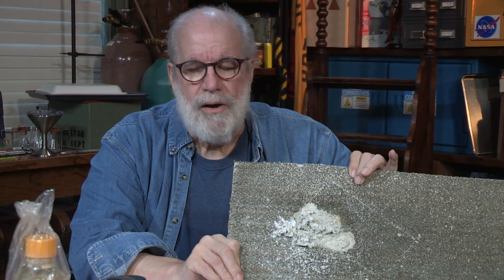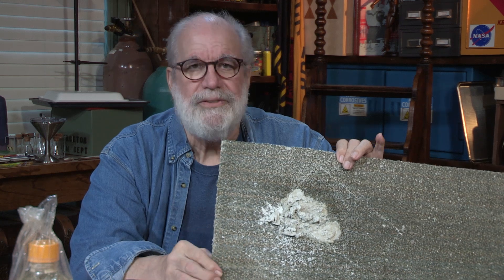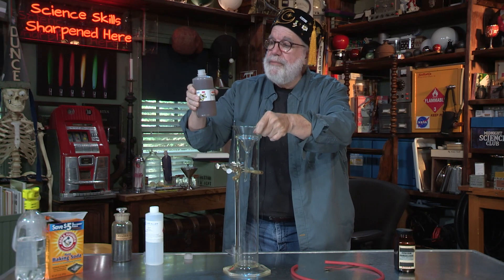I just wanted to show you something cool. I have carpet tiles here in the studio, which is also our lab, and we spilled some sulfuric acid. Better the carpet than me — that's what I always say. We're going to hang that on our wall of shame. I'm glad we saved this old acid because it's kind of going bad, but might as well use it.